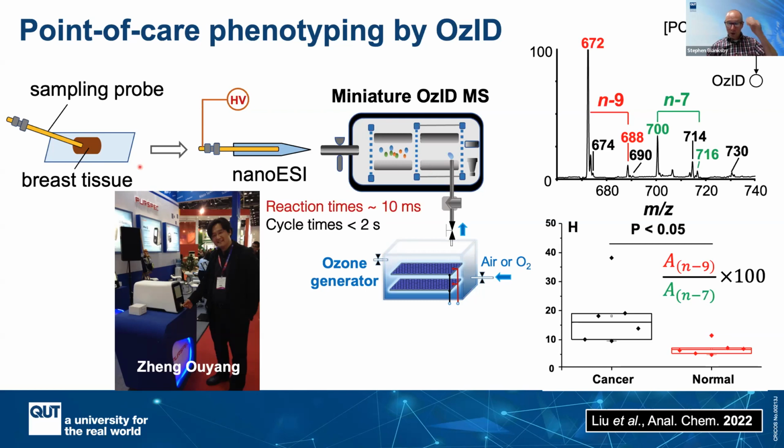And so what we were able to do is take these pinpricks of tissue, load those in the nano ESI, squirt those in, and mass select out the ion of interest and look at its profile of unsaturation. There wasn't evidence in this particular profile of necessarily aberrant or unusual unsaturation, but even just looking at the ratio of the two canonical 18-1 isomers carried by this complex lipid gives you statistically robust phenotyping of that tissue. So on the one hand, this technology will enable phenotyping, and using this isomer resolution is clearly giving a very tight and reproducible phenotype.